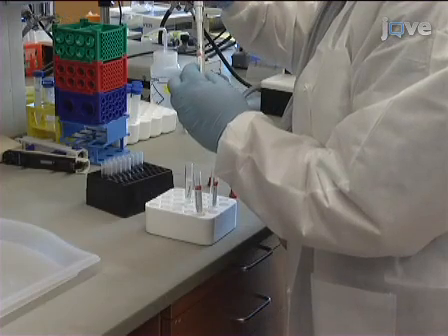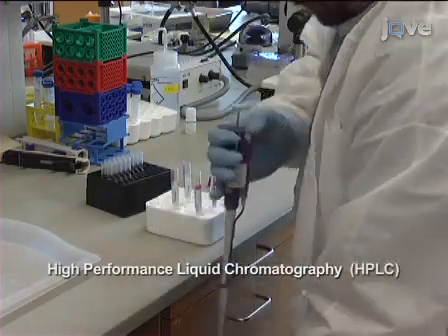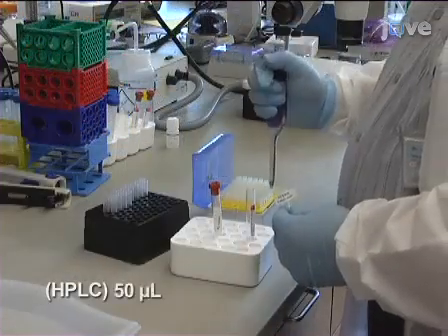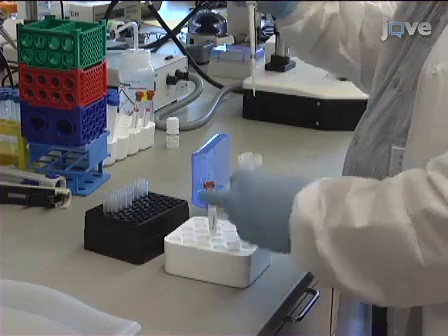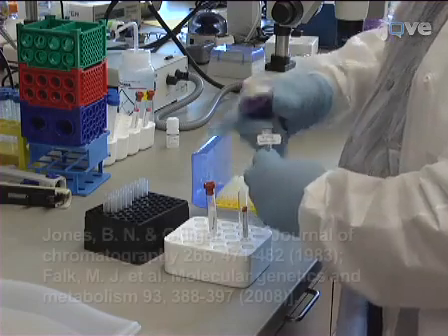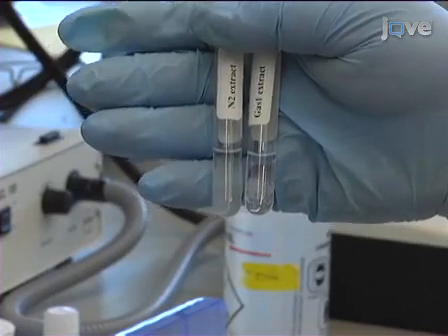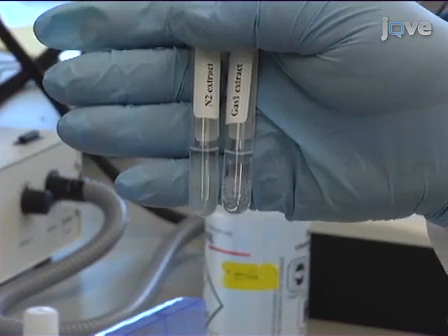The neutralized samples can now be prepared for metabolite quantitation by high-performance liquid chromatography, or HPLC, and gas chromatography mass spectrometry, or GCMS. For HPLC, separate 50 microliters of each neutralized sample for direct injection into the HPLC. Free amino acid quantitation is performed using pre-column derivatization with ortho-phthalaldehyde and fluorescent detection as previously described. The remaining neutralized samples will undergo extraction using an ion exchange resin for GCMS to determine isotopic enrichment in amino acids and organic acids as shown in the next section.